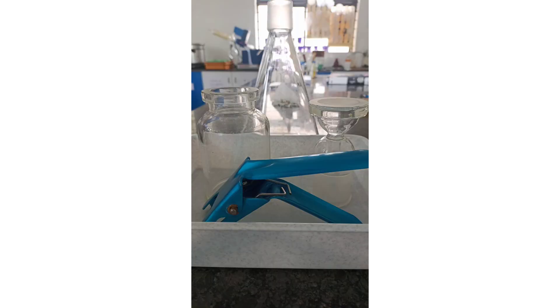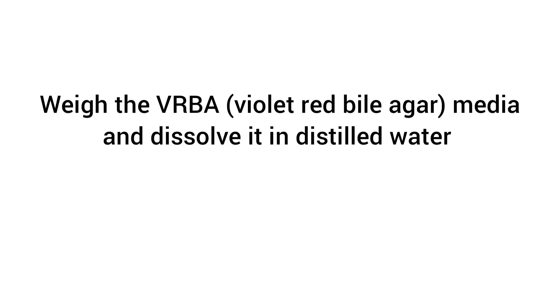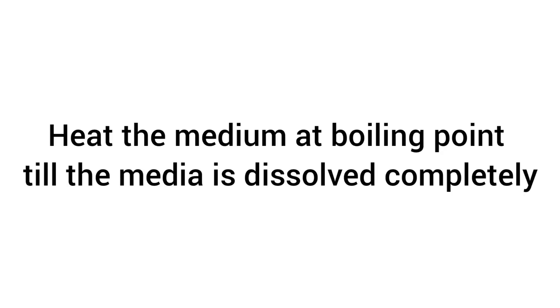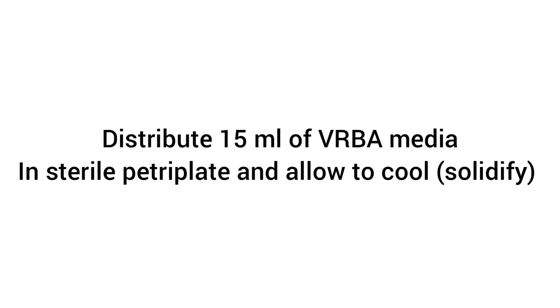Firstly, autoclave the membrane filtration apparatus. Weigh the violet red bile agar medium and dissolve it in distilled water. Heat the medium to boiling point until dissolved completely. Distribute 15 ml into sterile petri plates and allow to cool.